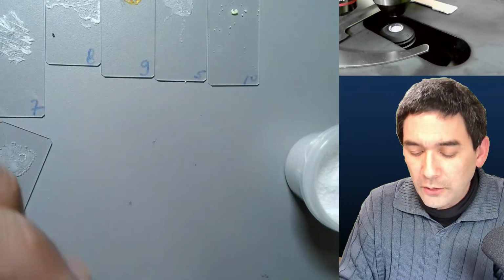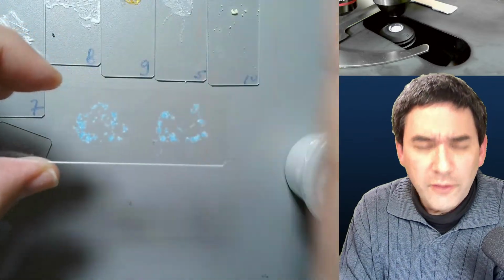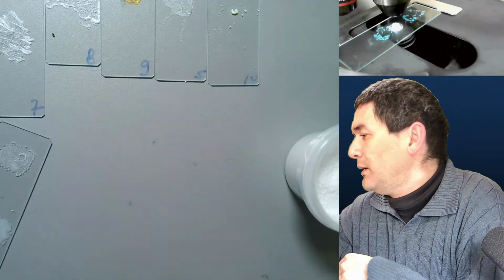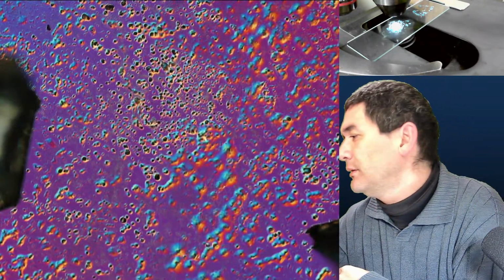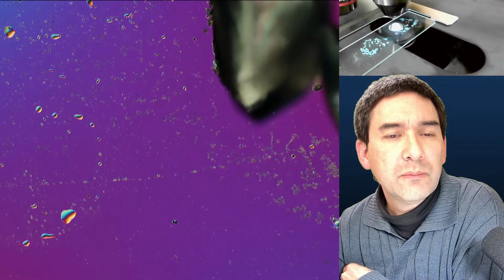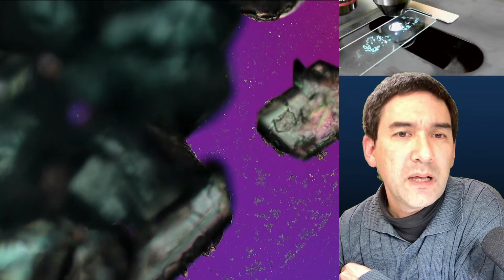It also took quite a long time. And then actually, as I said, the crystals do not look very flat, right? Indeed, however, recrystallization did happen. Some of them started to look like crystals again in one of the very small places. I could actually see this happen, but I can't find it now again.